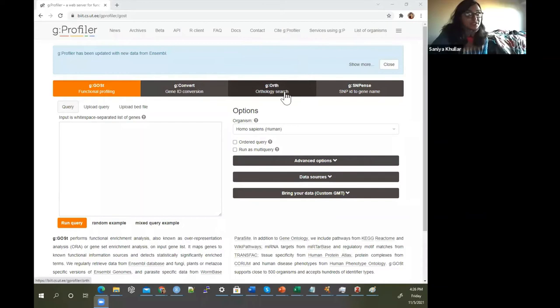I have another video where I talk about another resource like Metascape where you can also get gene set enrichment analysis information. From G profiler you can also get gene ID conversion, orthology search, and SNP ID to gene name as well. There's a lot going on.